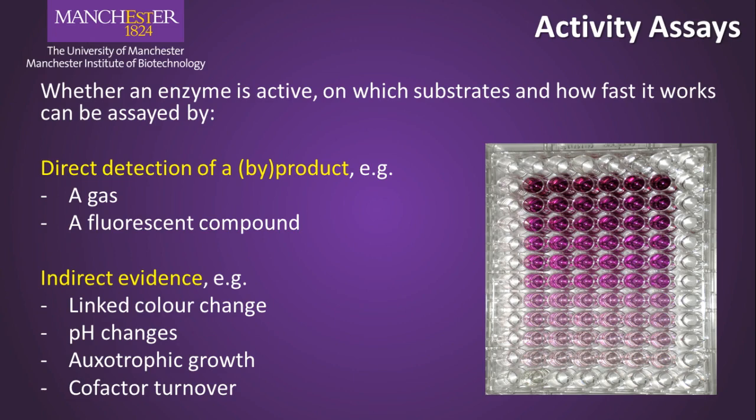When an enzyme has been selected, produced, and is available in a suitable formulation, i.e. as whole cells, cell lysate, or in its isolated form, the activity of the enzyme can be assayed. This is often done to find out which chemical reaction the enzyme performs, and how well it does this under which conditions. It can be done via direct observation of the product formed, or by an indirect detection method.